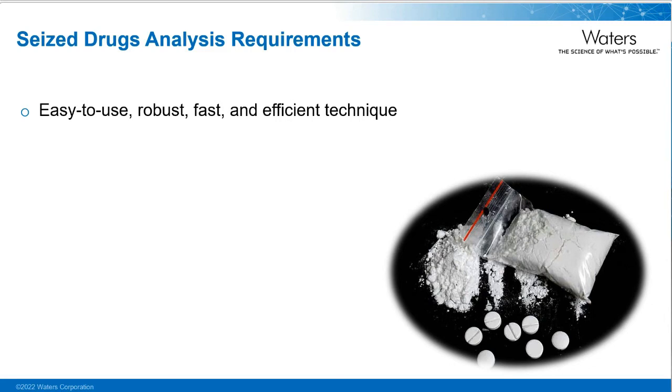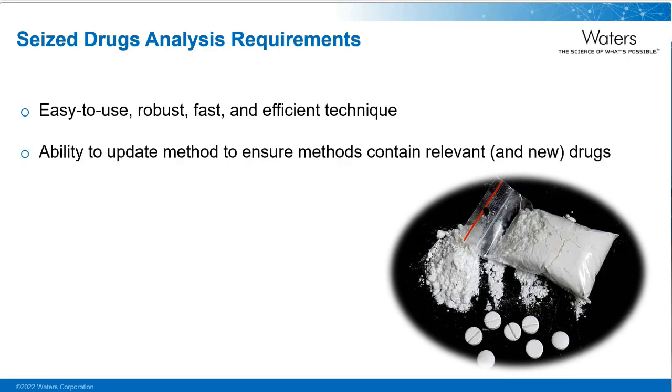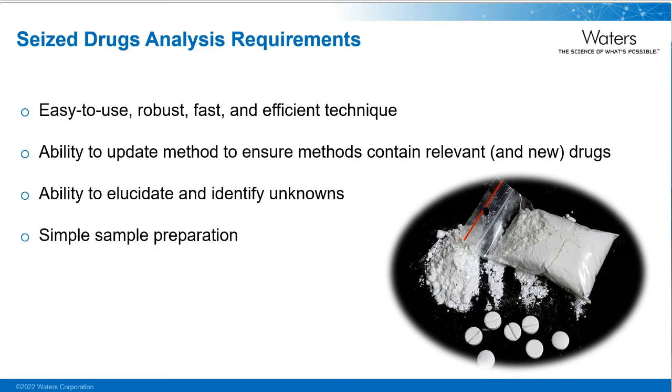Any newly developed methods need to be easy to use, robust, fast and efficient. The method should have the flexibility to be updated, have the ability to elucidate and identify unknown peaks, and not have the added burden of performing time-consuming complex sample preparation.